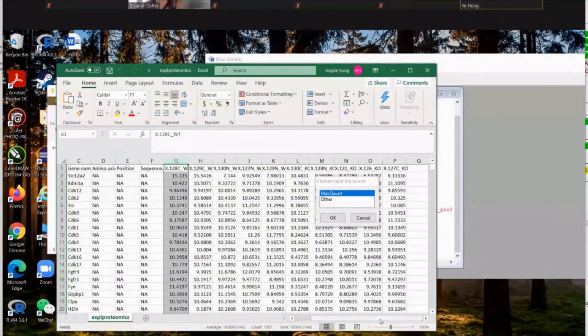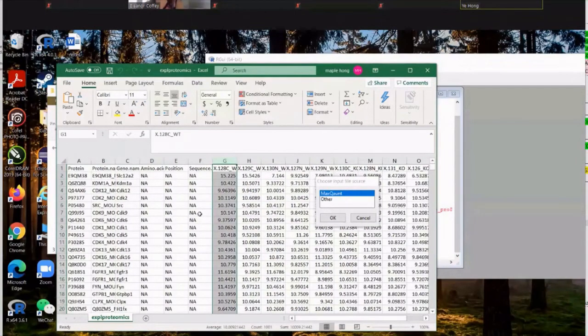So normally if you have a phosphoproteomics data set, you would have all of these 3 not in NA, so they would have values. However, if you only have your proteomics data, you can just enter NA for these sets, and the pipeline would know this is a proteomics set, and it will proceed normally. It wouldn't give an error.